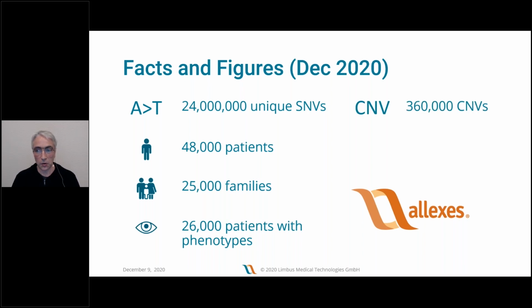Please note that we are also collecting information about copy number variations because our software also generates information about copy numbers. And this started a couple of years ago, and we've already created data sets from about 16,000 cases in the database.